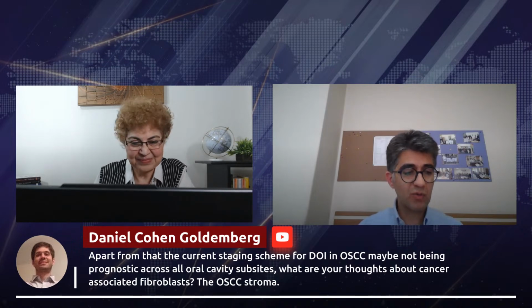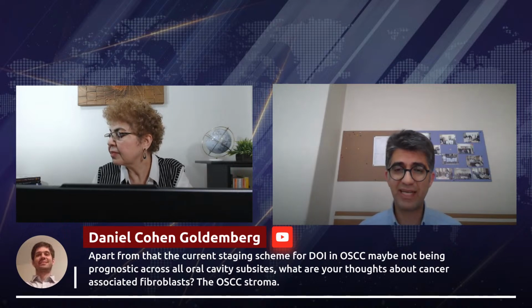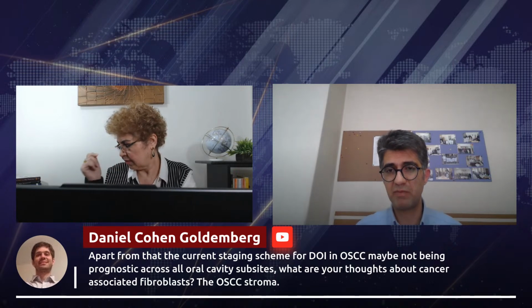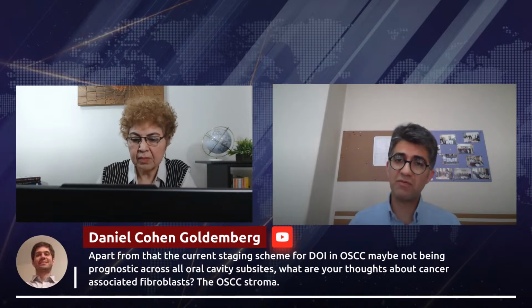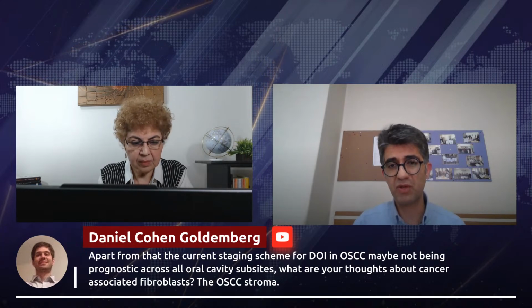True. You know, we have multiple oral squamous cell carcinoma cases in our center, Cancer Institute Hospital, and also Danish Path Lab. In all of them, for resections, we assess depth of invasion.